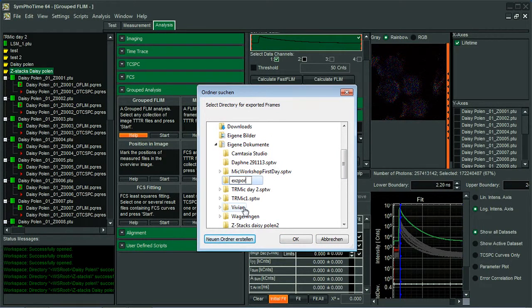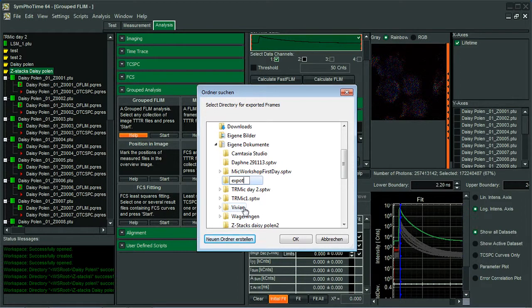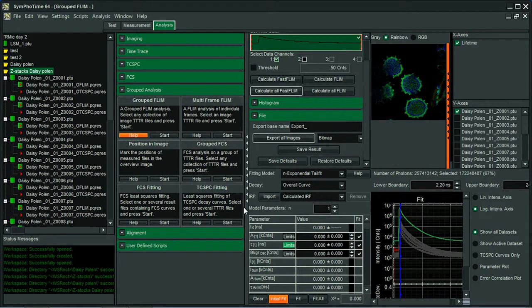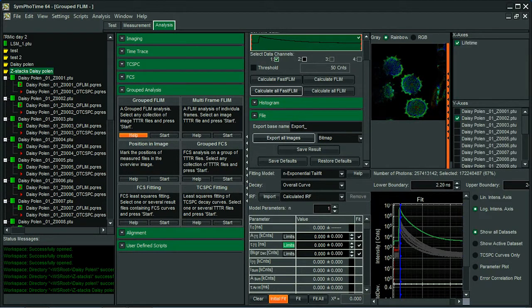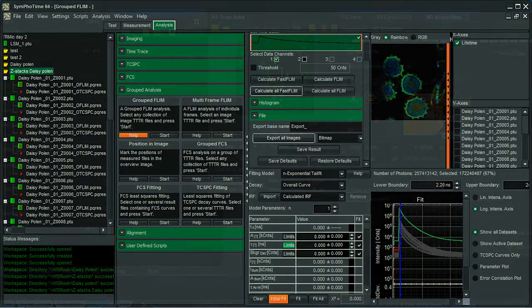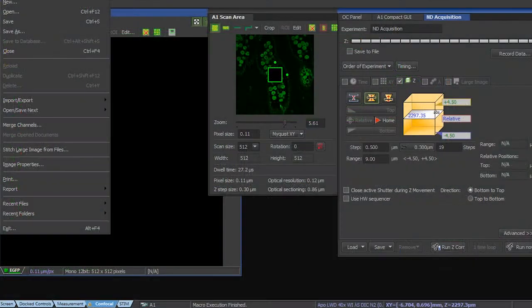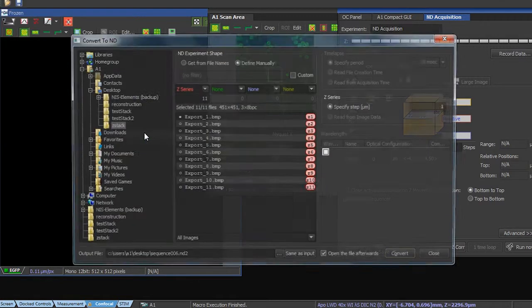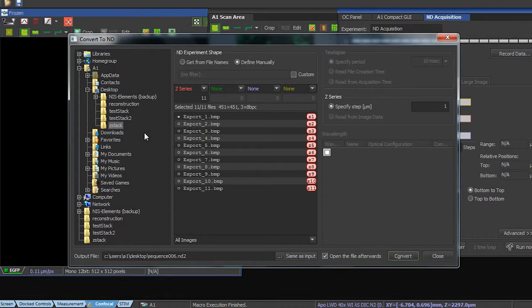So now, once the folder is created, the idea is to transfer all those images to the NIS software, so we can take advantage of its facilities and create 3D images of the flint stack. So I go to import export, create ND file from sequence.